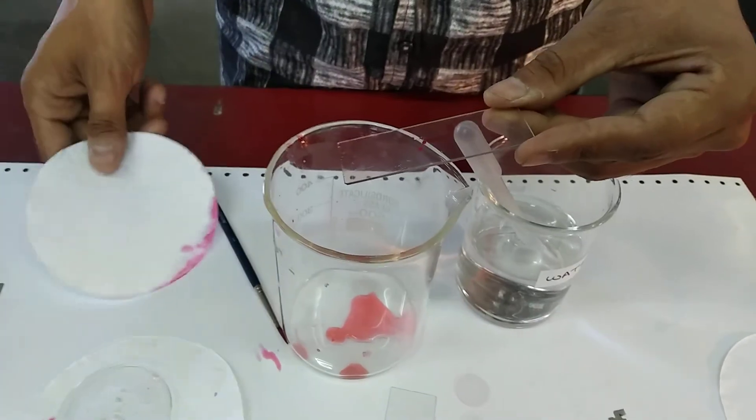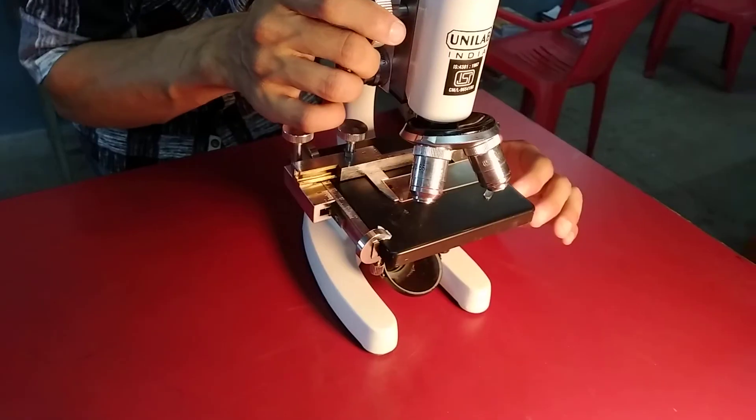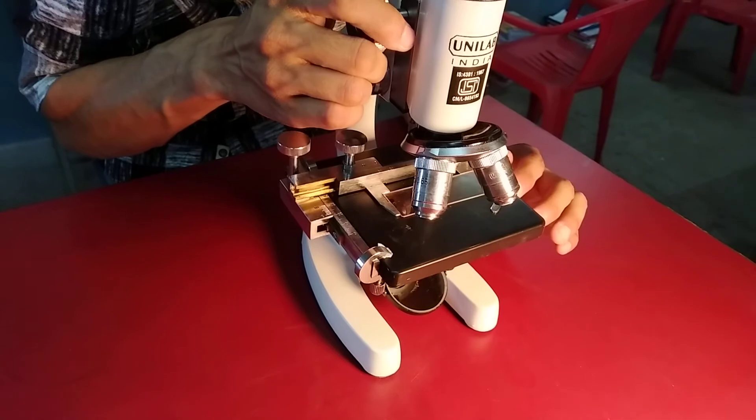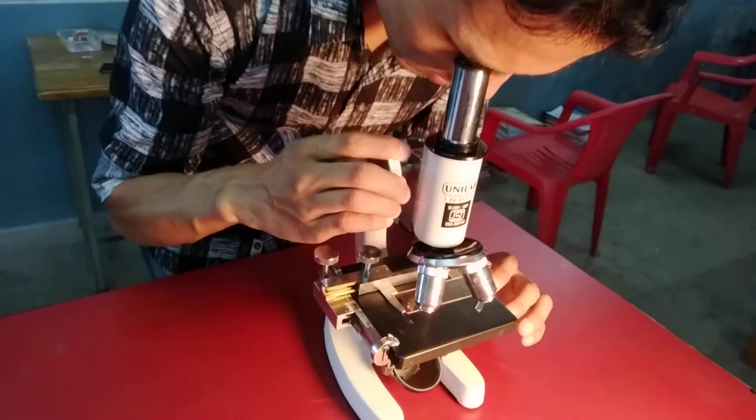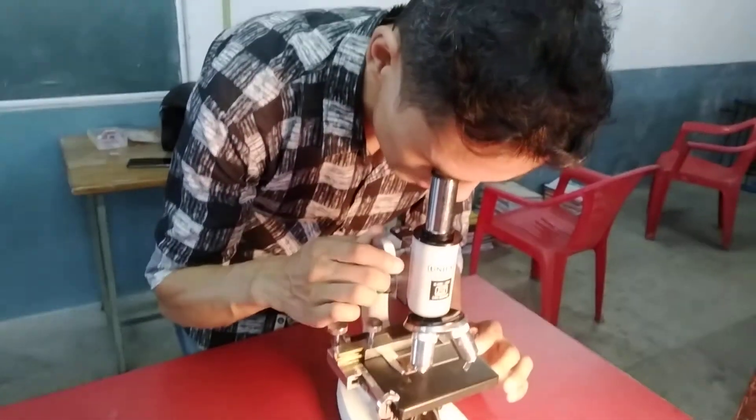Then put it under a microscope and observe it. Focus on the properly stained section.